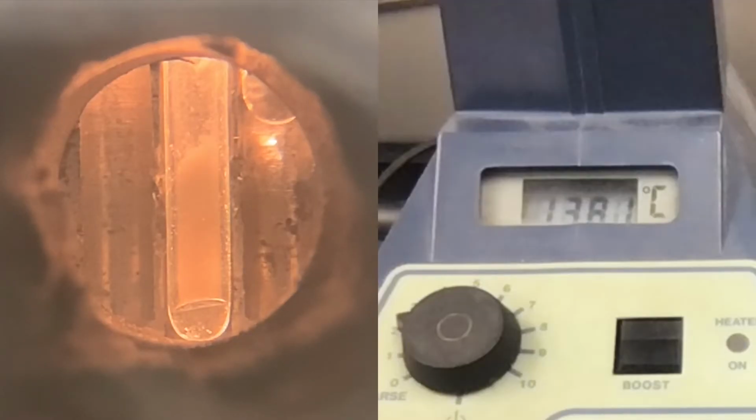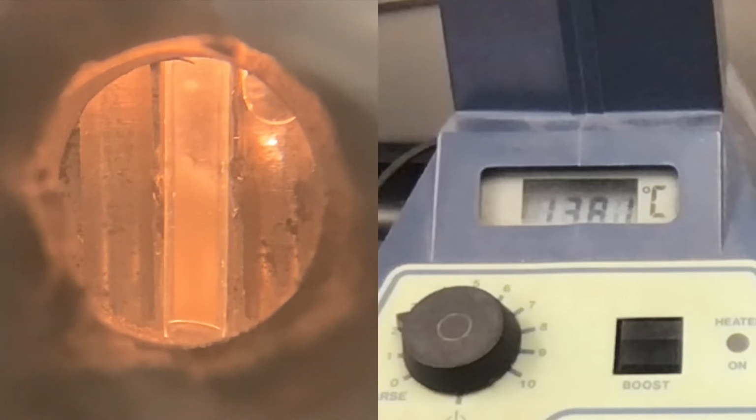All right, using different devices for recording the temperature, but it reads 138.1 degrees Celsius right now. I've got my tube in here. It's a nice white crystalline powder. And we'll go ahead and start heating this up here. Ideally, you want to raise the temperature about 1 degree Celsius per minute. I tend to do it way too fast on the videos, but we'll go ahead and get our data and be good to go.